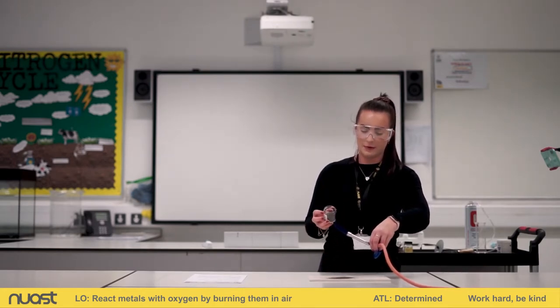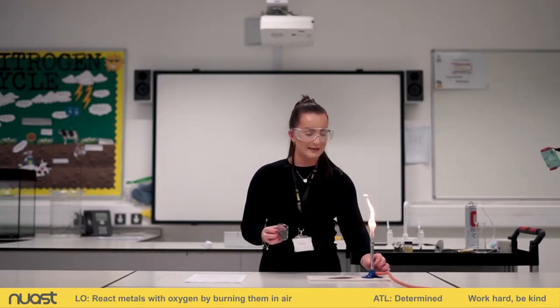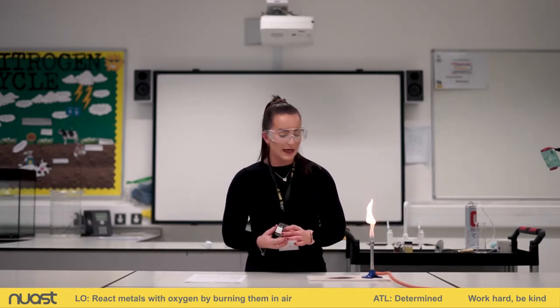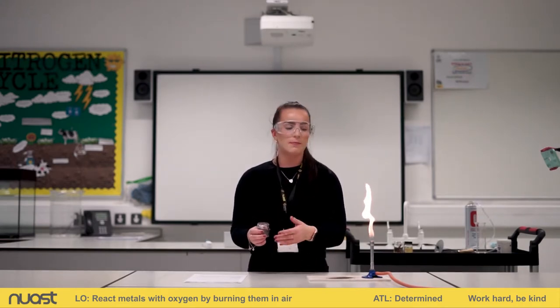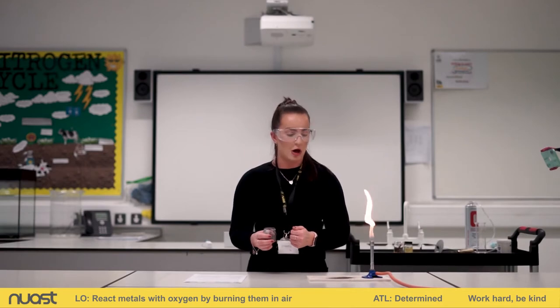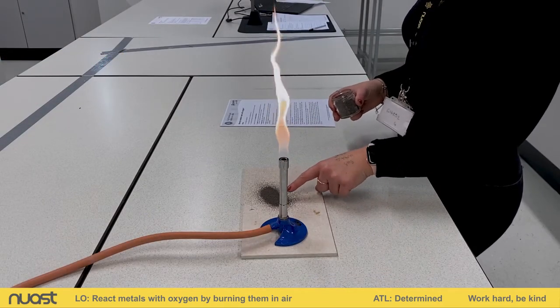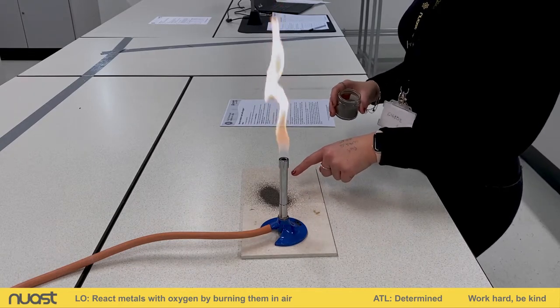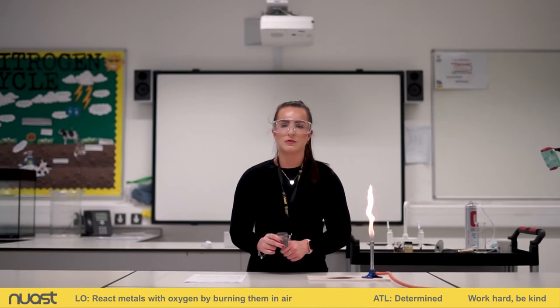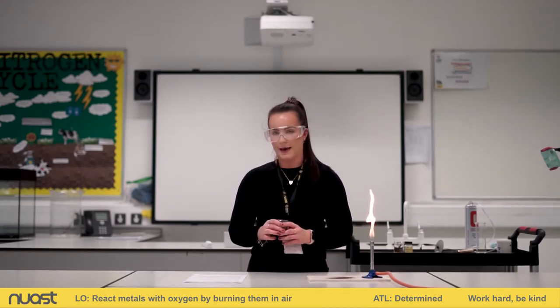Okay. So you should have been able to see as those iron filings were passing through the Bunsen burner, we got those bright white sparks. Okay, there wasn't many of them, but there was a few white sparks. And what I can see now on my heatproof mat is the colour of these iron filings has gone slightly darker. Okay, so have a think about what that product might be from the iron filings reacting with oxygen in the air.